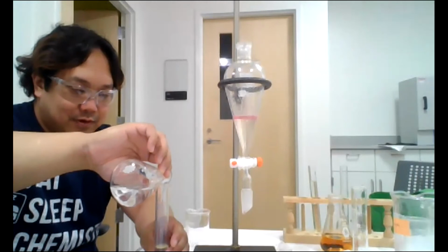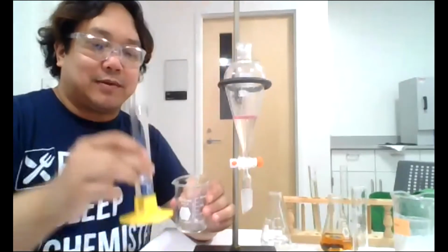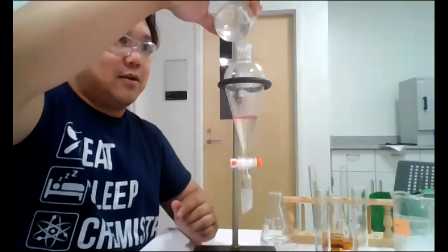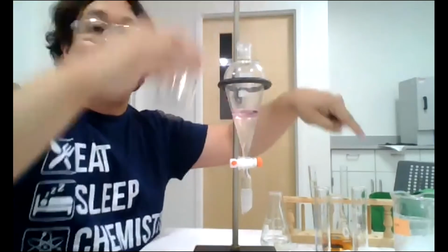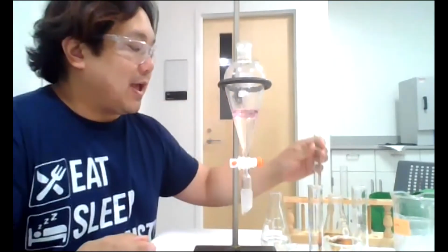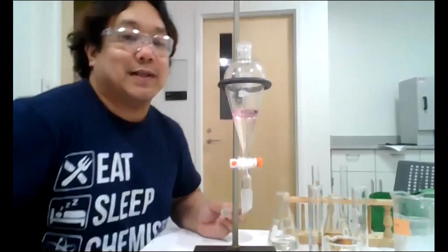What am I going to do? Good practice is I really wanted to get as much of this aqueous layer into the separatory funnel. So why don't I use some of this pure organic layer to rinse the beaker. Remember what happened to our first organic layer? It went into the waste, right? Because what are we analyzing? Remember, we are comparing the aqueous layer. How well did we clean this by doing a liquid-liquid extraction? So there's my second serving. It's less intense because it's less dirty, right? The laundry was less dirty.